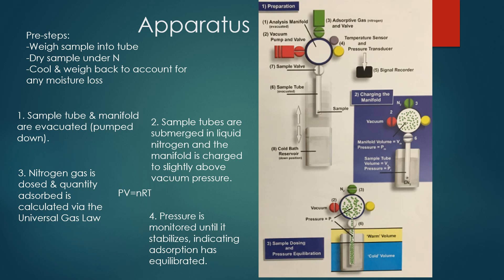We input that new sample weight into the computer program and put the sample tube into the manifold. Then the tube and manifold are evacuated. The sample tubes are submerged in liquid nitrogen - this has to do with keeping conditions at ideal temperature. Then the instrument doses with nitrogen gas and the quantity that's adsorbed is calculated via the universal gas law. It monitors the pressure until it's stabilized, which indicates adsorption has equilibrated, and the analysis can then go in reverse.